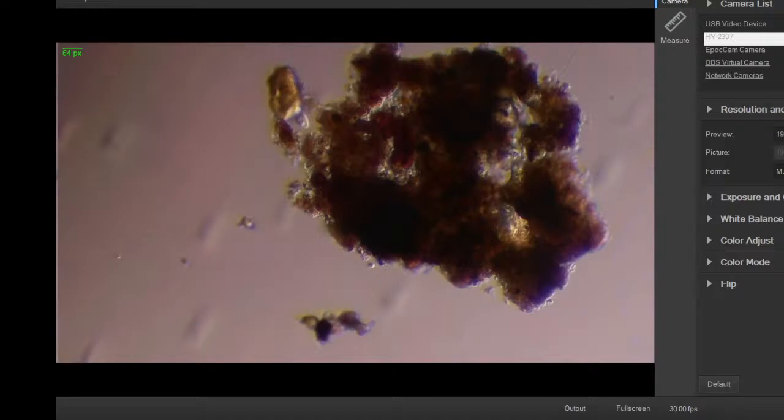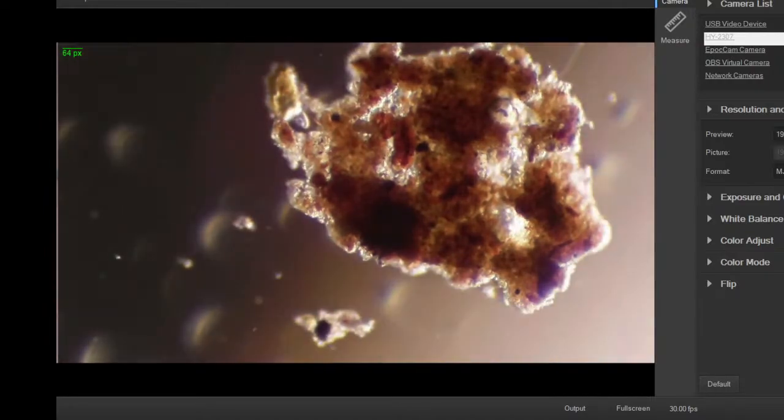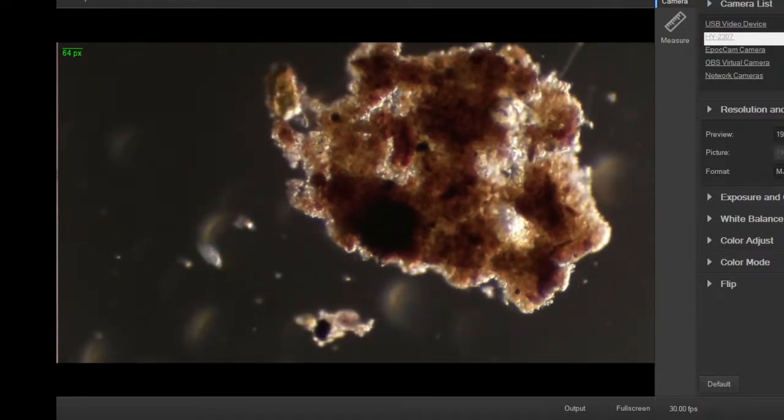Change the view of it shortly here. A little tiny guy moving there at the bottom, just to the left of the cluster. It's kind of in the edge of it at the bottom. Let's change the lighting a bit here. There's some dark fields. Very tiny guy at the bottom left, ticking off. Very jerky, like it's a flagellate.